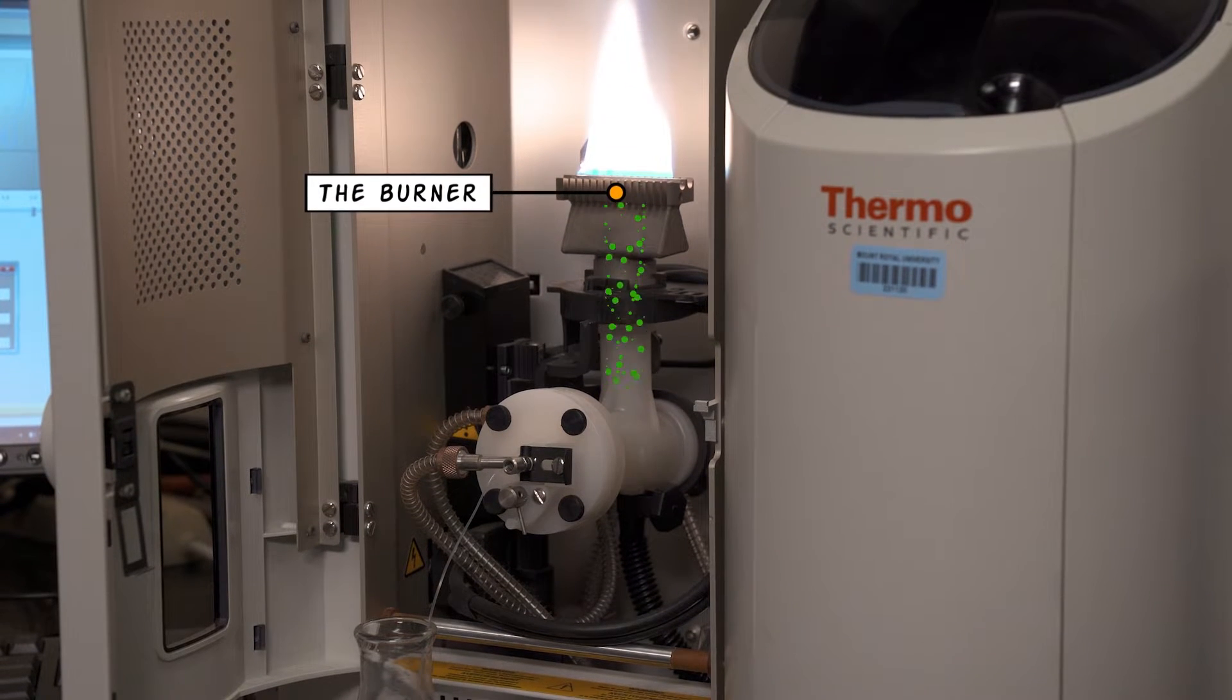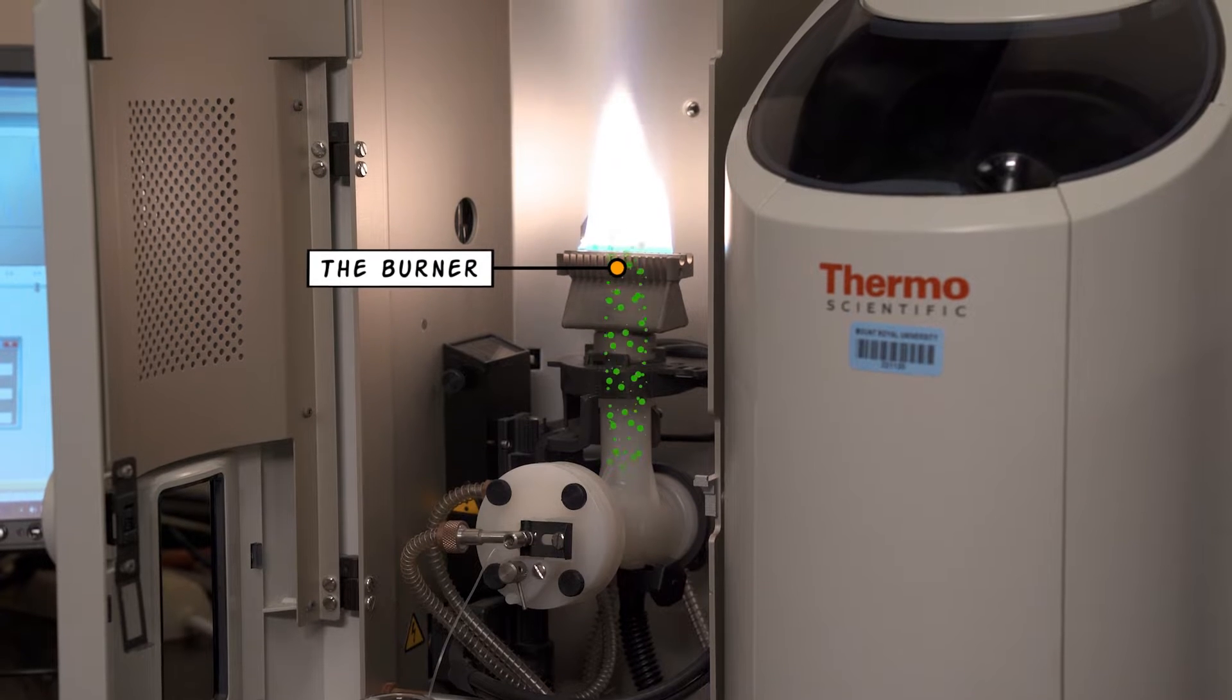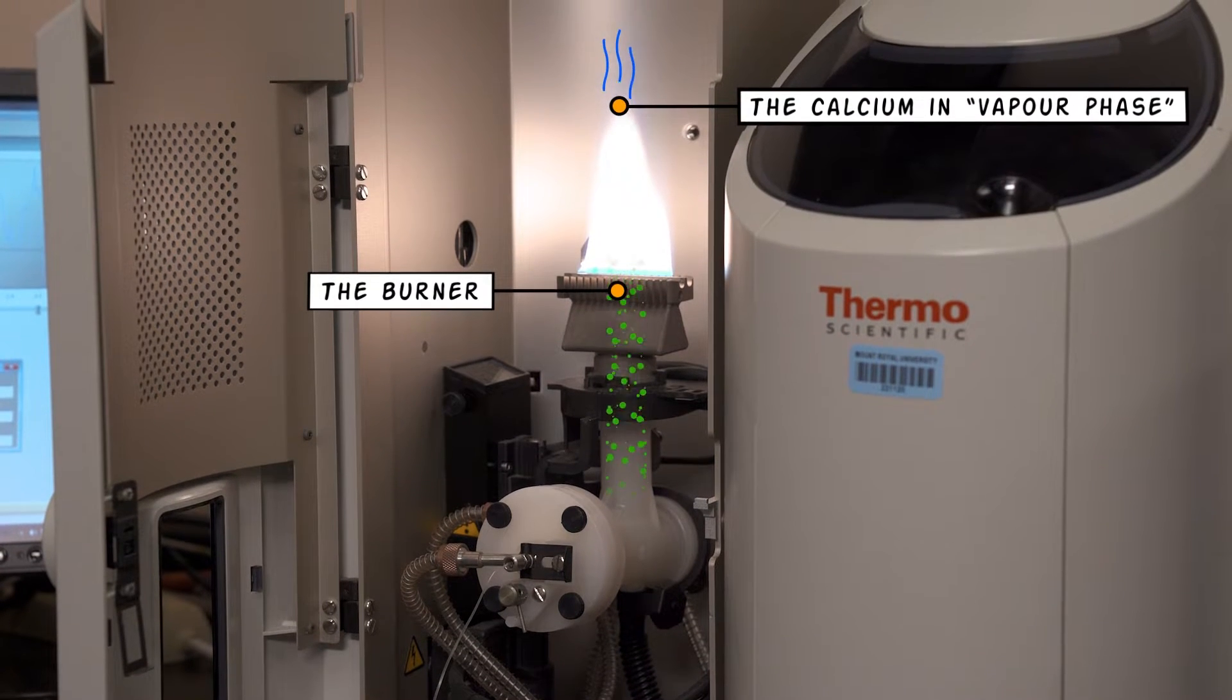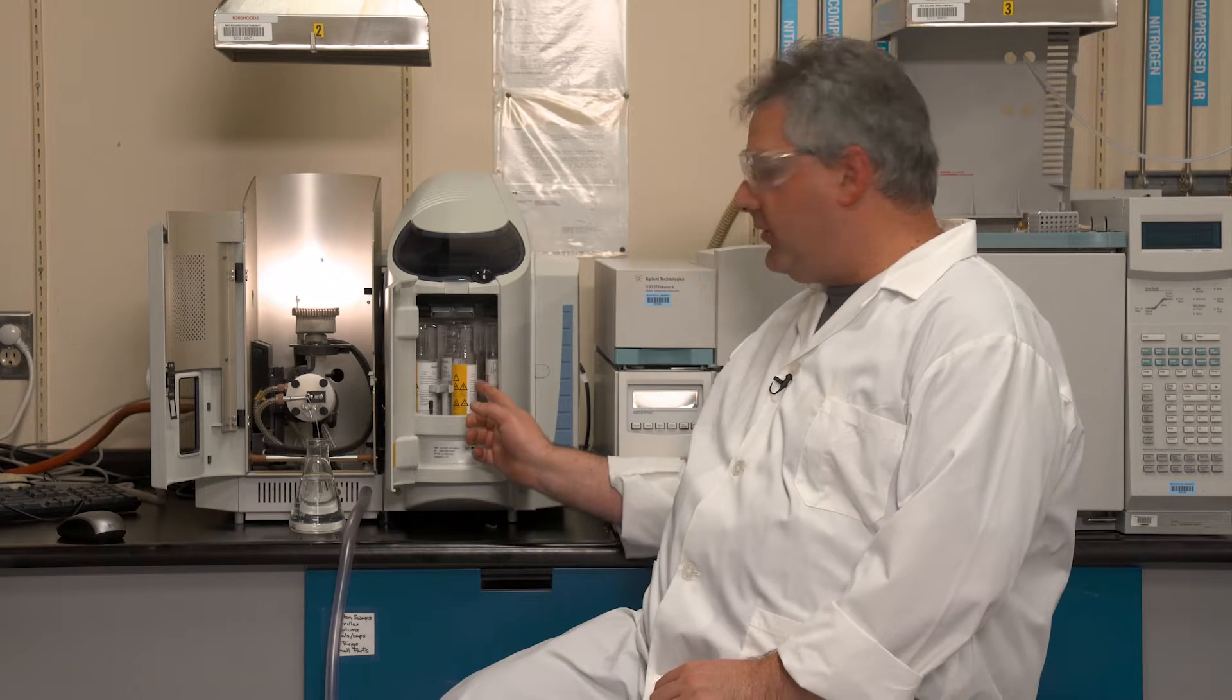Combustion of the sample begins when the mixture passes over the burner and is lit on fire by the flame, putting the calcium in the vapor phase. The sample is burned at a whopping 2300 to 2400 degrees Celsius, the same temperature used to weld metal. As a comparison, lava flows run at between 700 to 1200 degrees Celsius, so our water samples are being burned at twice the heat of a lava flow. The calcium vapor absorbs light from a lamp such as this one.